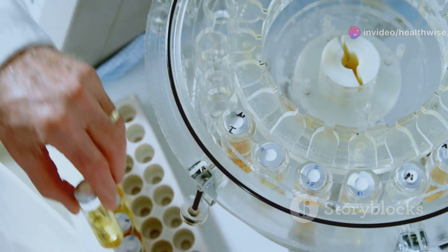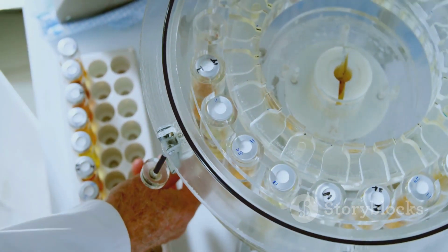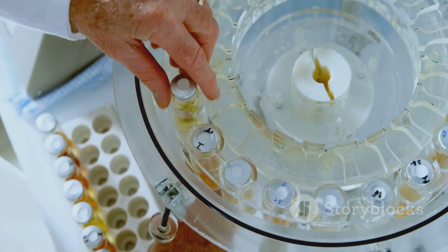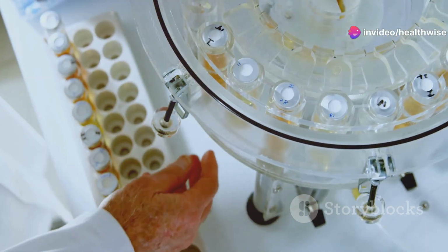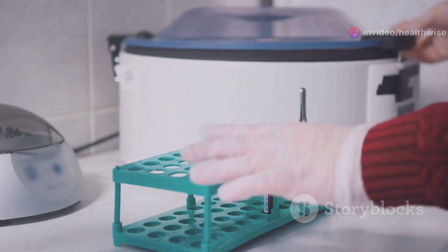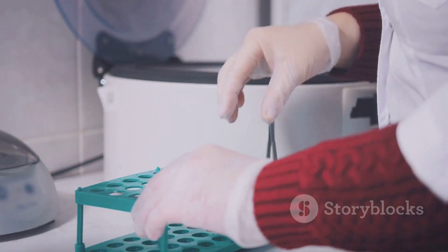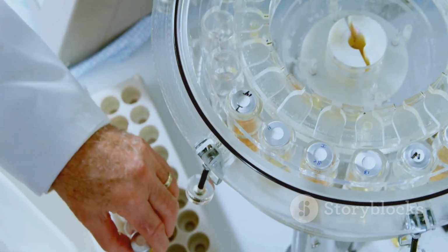1. Balance is key. Before you even think about turning on the centrifuge, make sure your sample tubes are properly balanced. This means having an equal number of tubes placed opposite each other in the rotor, or using a single tube with a counterbalance. 2. Secure the lid. Always make sure the lid is securely fastened before starting the centrifuge. This prevents accidental spills and ensures your safety.